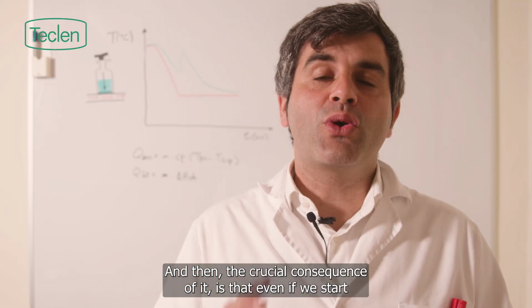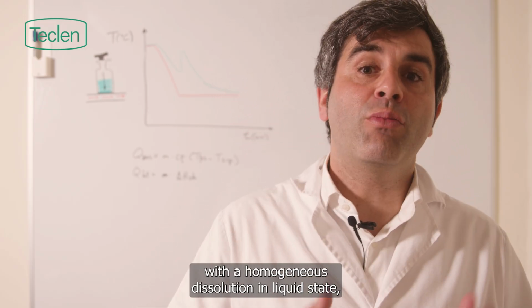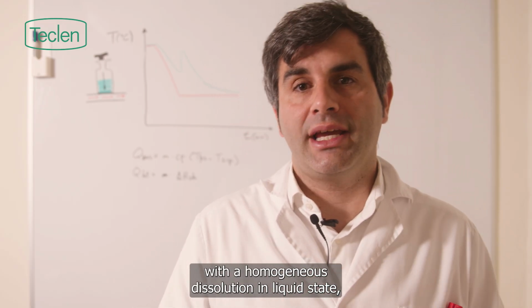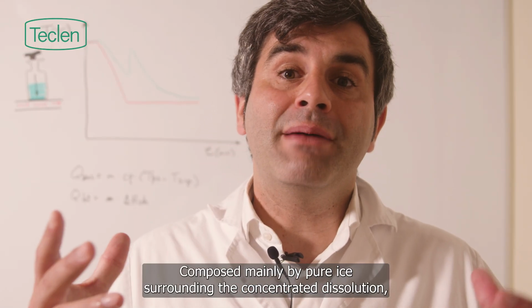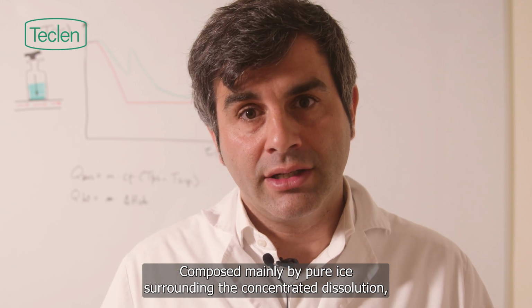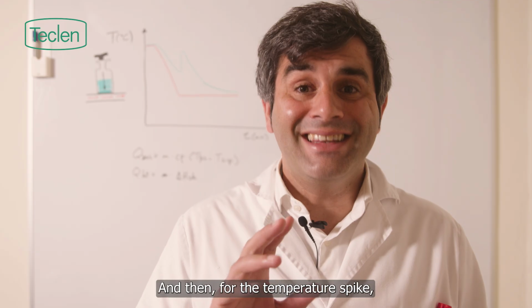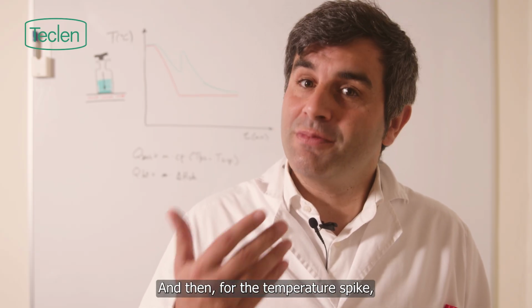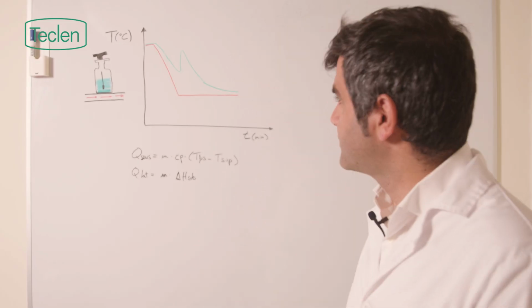And then the crucial consequence of it is that even if we start with a homogeneous dissolution in liquid state, we end with a heterogeneous solid, composed mainly by pure ice surrounding the concentrated dissolution, also solidified. And then, for the temperature spike, I need to go to the physics of this phenomenon.